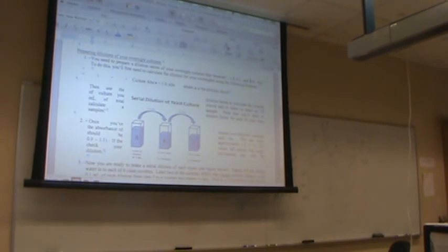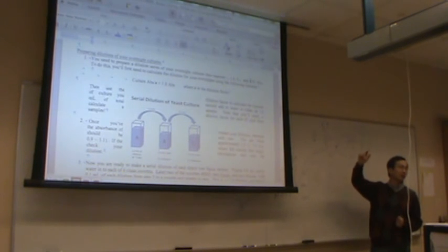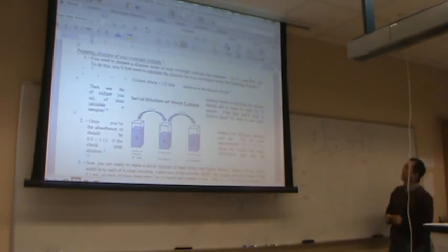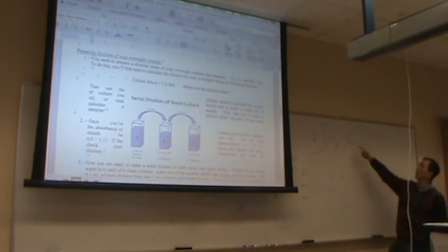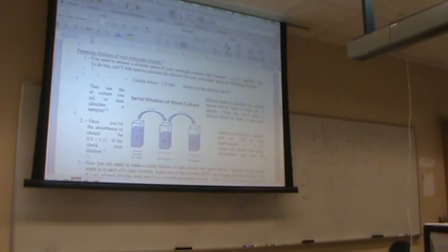And you start with 5 milliliters and then 100 milliliters? No, I start with a 5 milliliter culture. I spin it down and throw all the liquid away. At the bottom there will be a pellet of cells. I add 100 microliters of water to that, and after you add the 100 microliters of water, you put that whole thing into an Eppendorf tube, a small 1.5 mL tube, the white tube there. The 5 mL tube is this one, called a Falcon tube.